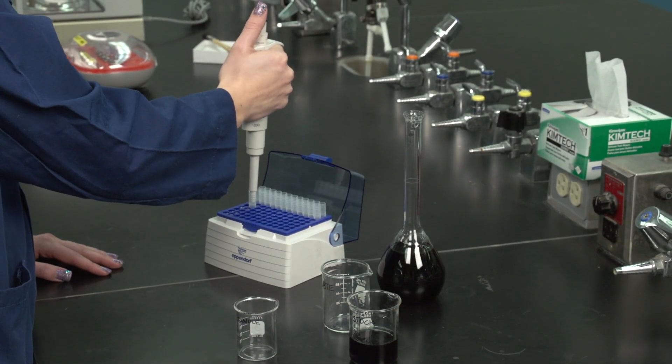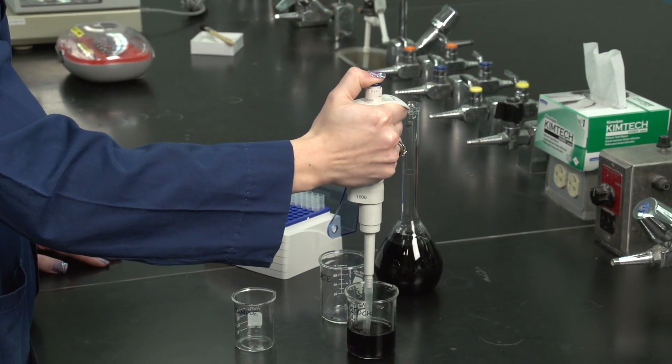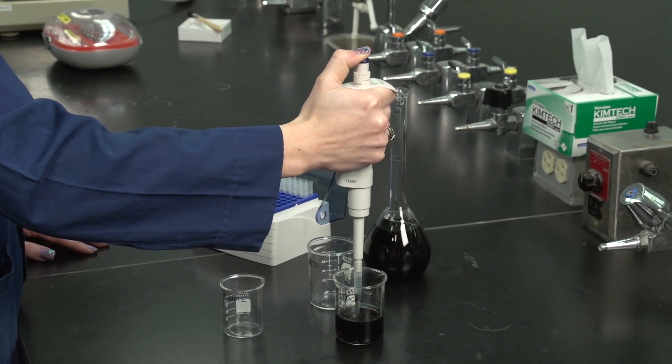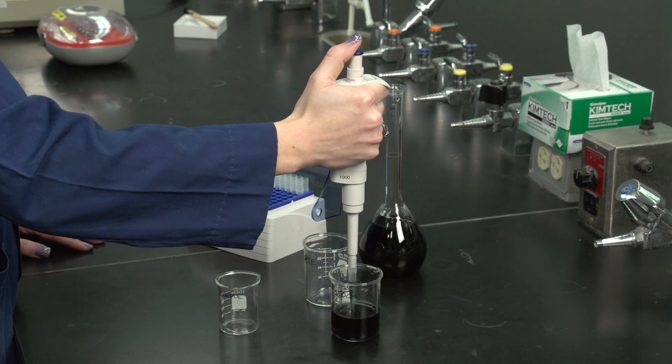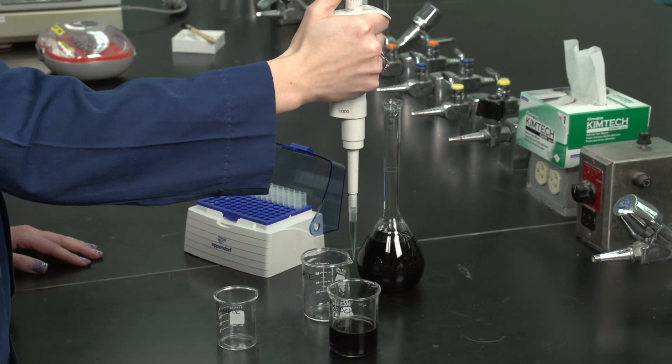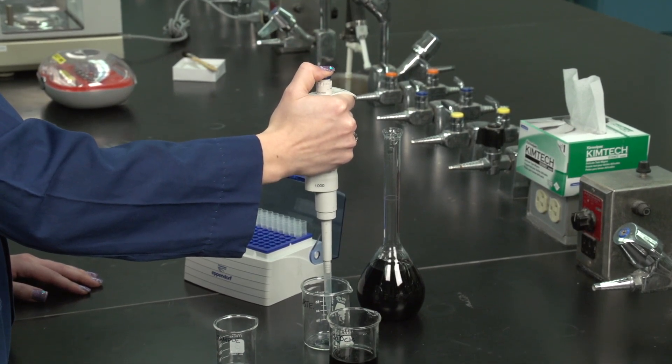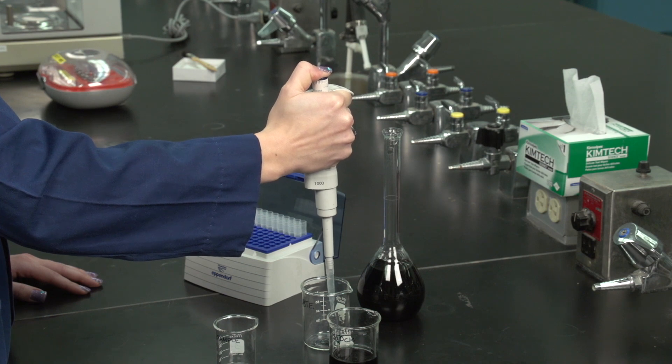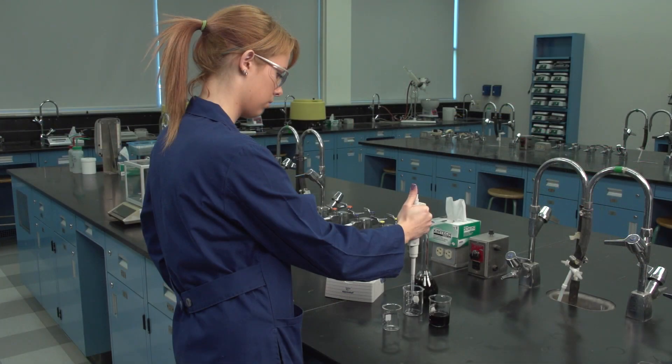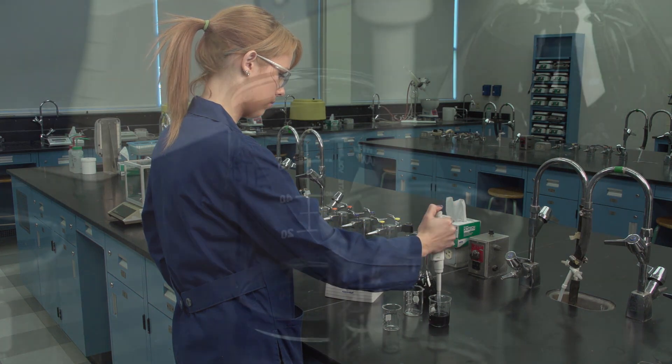Rinse the pipette at least three times with the sample. Depress the plunger to the first stop, then return it to the initial position without allowing the plunger to snap back. Withdraw the tip from the solution and dispense the rinse by pressing the plunger to the first stop. Wait until the liquid stops flowing, then press down the plunger to the second stop. The rinsing procedure is identical to the micropipette procedure, but the rinses are discarded.